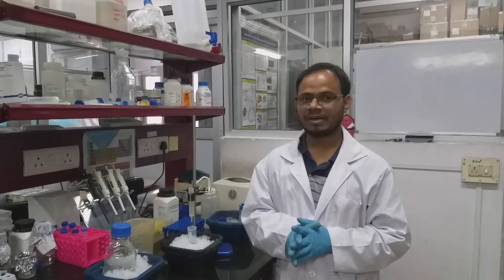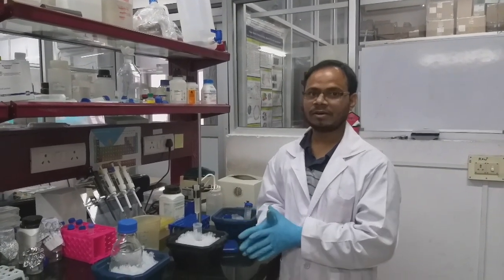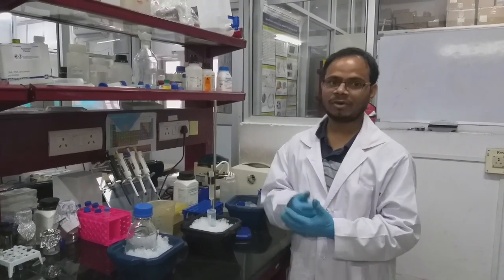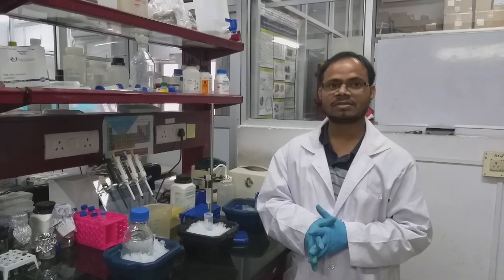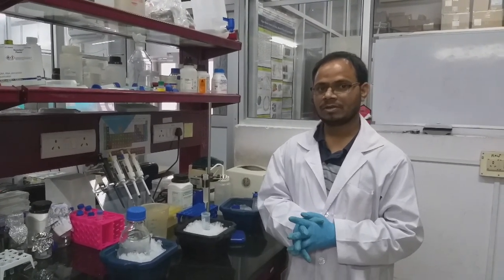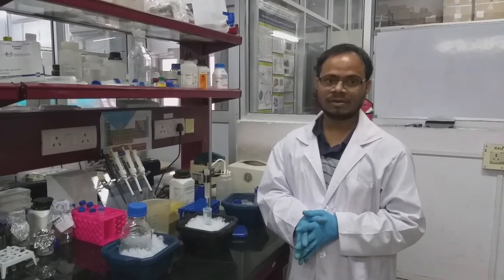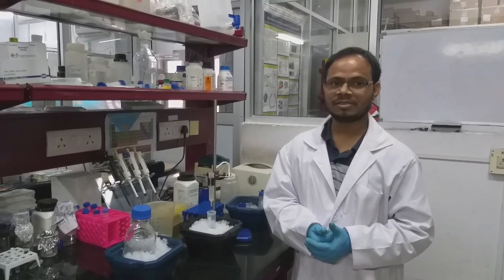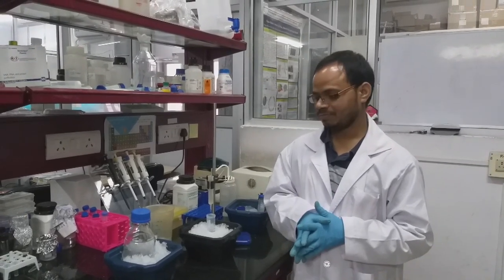For all these buffers, the pH should be adjusted beforehand. It's not like you first take the lysis buffer and then add the imidazole, because that may change the pH of the buffer. So after combining the lysis buffer with the imidazole, then we have to adjust the pH so that throughout the procedure the pH won't change.